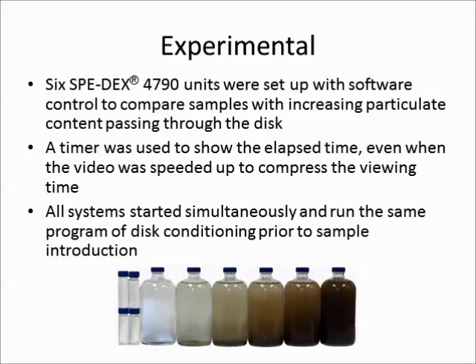Next, you'll see samples of varying particulate matter processing through a solid phase extraction disk. You'll also see a timer to give you an idea of how long the process really takes.